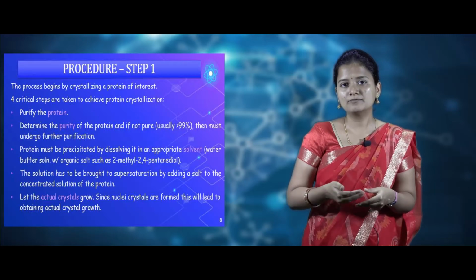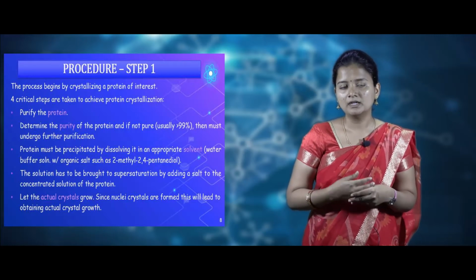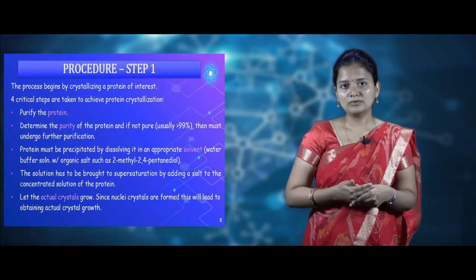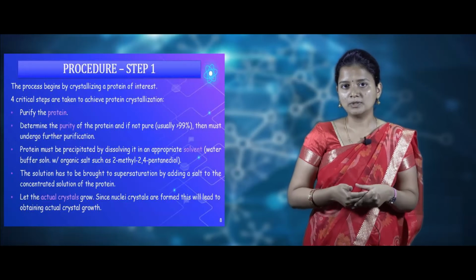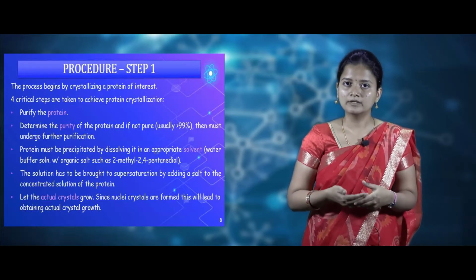Nucleation is the formation of the nucleus over the crystal structure. It is a very stable form. And then finally, crystal growth. Crystal growth is the last stage of crystal formation, where nuclear growth will stop, whereas the crystal will tend to form bigger in size. That is called crystal growth.